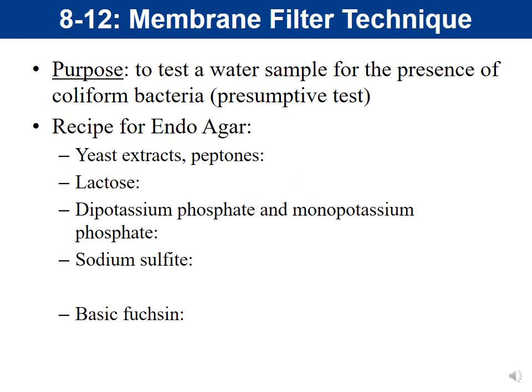So now we're going to move on to day 2, meaning what we would do on the readout 48 hours after our incubation. And so this would now be what we would do on the following class period. So now we would look at our results for our membrane filter technique.